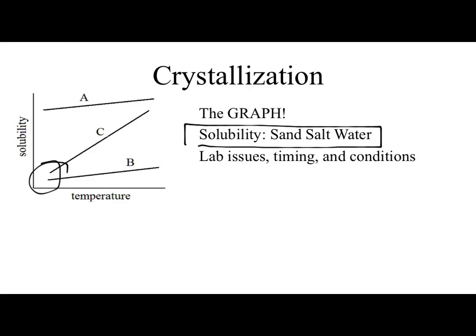If we add a lot of solvent, what we're trying to look at is that temperature change. So we can take a lot of room temperature solvent and cool it down. The difference in temperature there is so small that more than likely you wouldn't get any crystals back. So when you go to dissolve your compound, your first step is not to just dissolve it, but to dissolve it in as hot a temperature as possible. So it's a hot dissolving process.